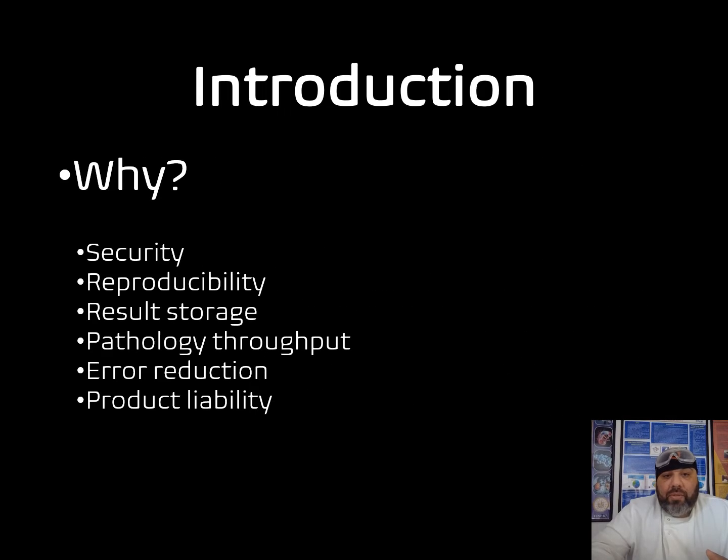So to begin with, I'm going to highlight a little bit of introduction, and the main question as part of this introduction, I thought I'll ask the question and hopefully help answer the question as well, as to why is pathology automation required in relating to laboratory medicine and throughout pathology. So one of the main reasons is security.